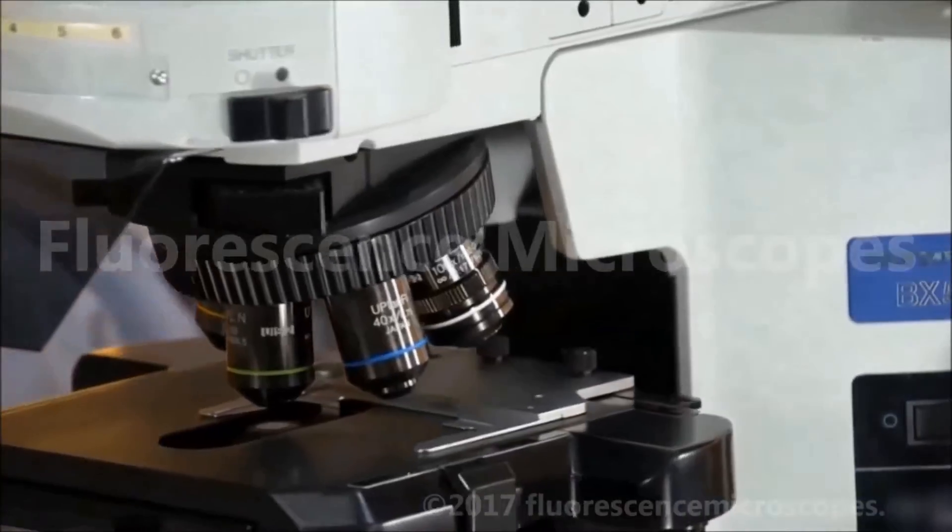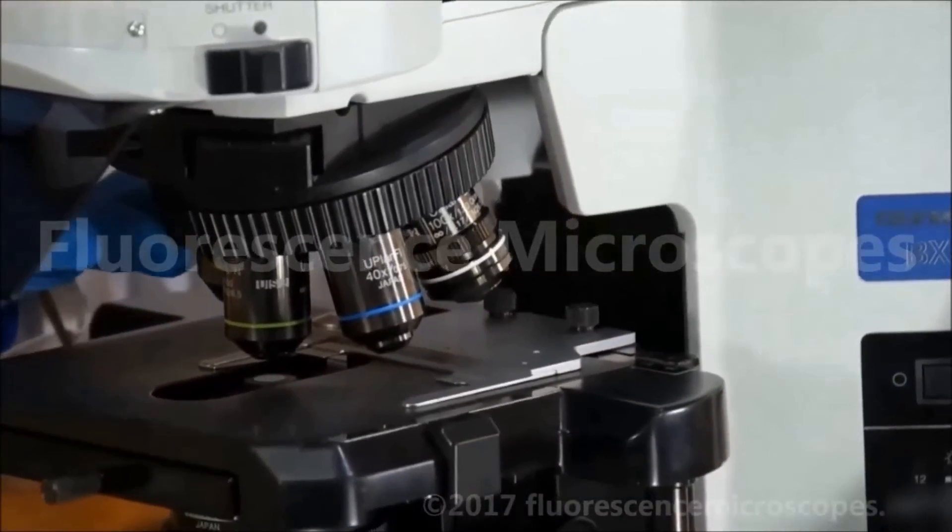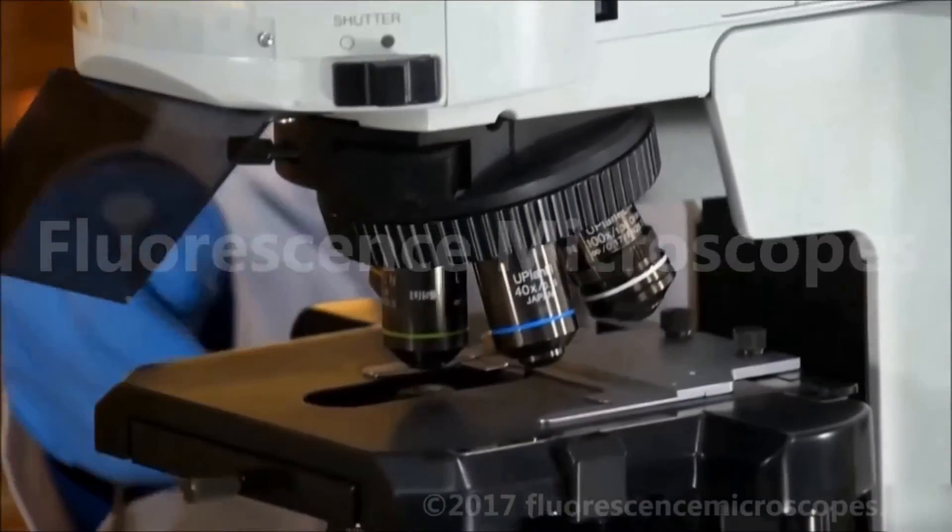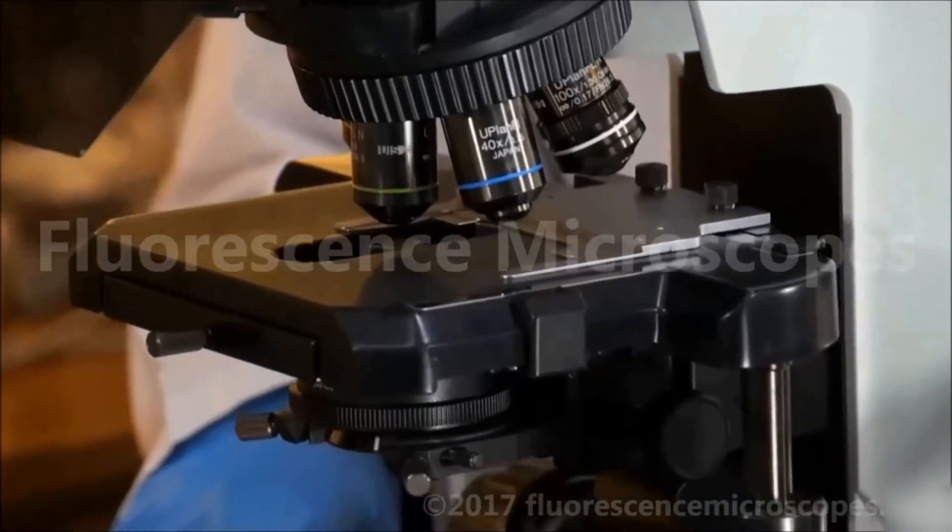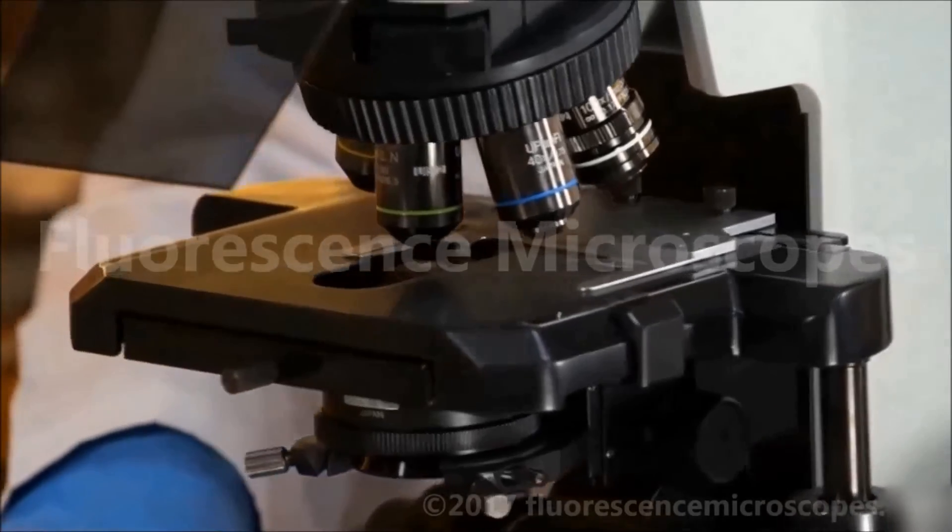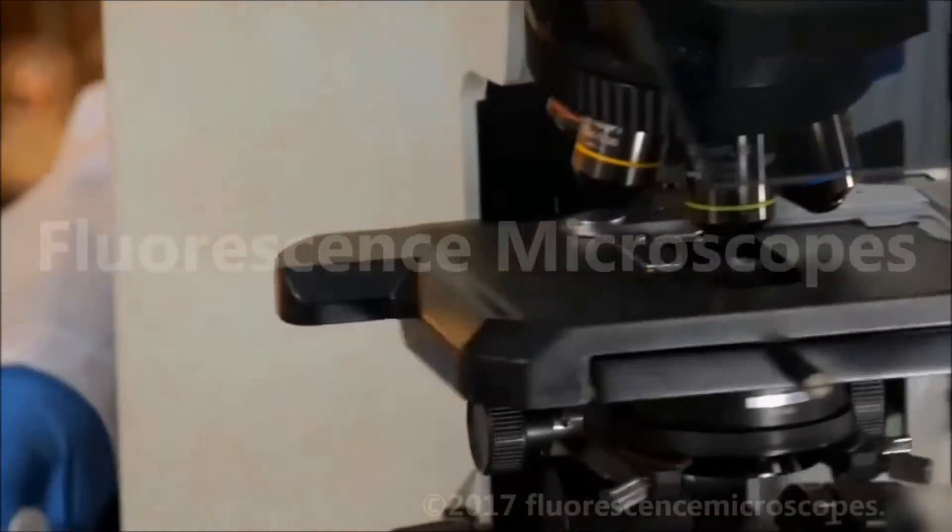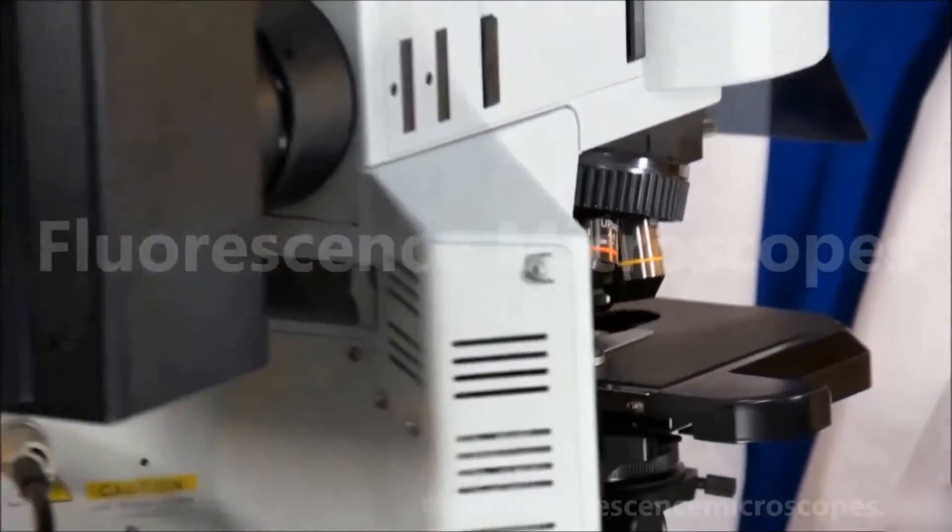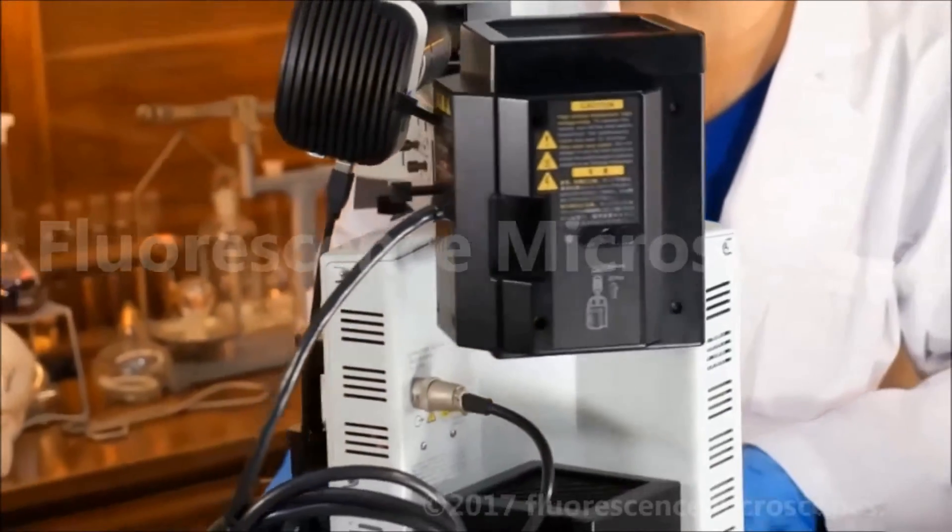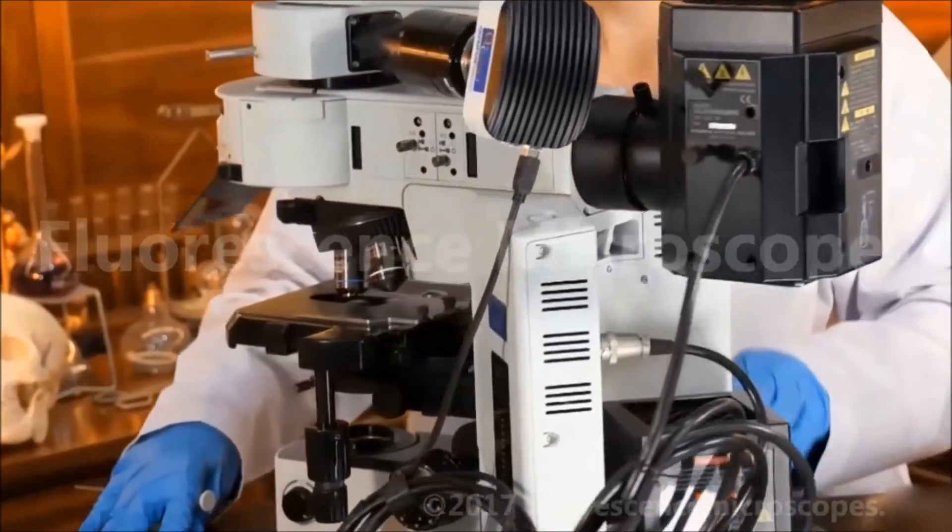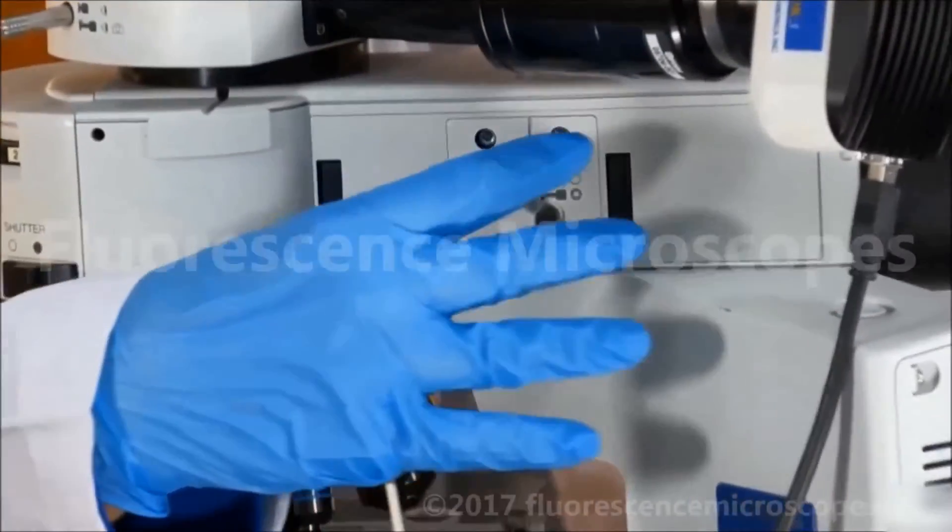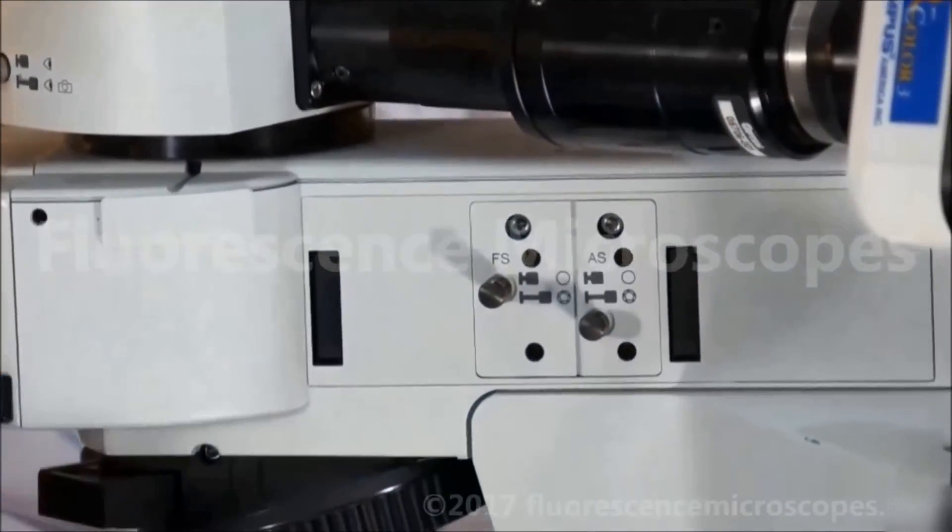We can configure your objectives however you want as well. We have a lot of different objectives. You have a field stop and an aperture stop both with centering all on this side. That's on the epi illumination light path, the vertical illuminator.